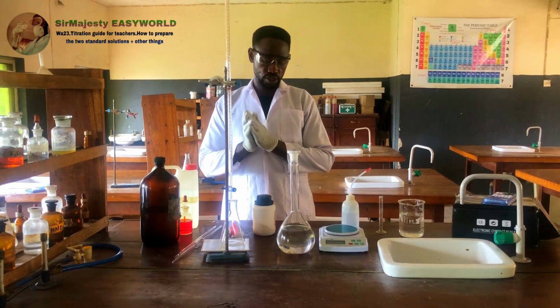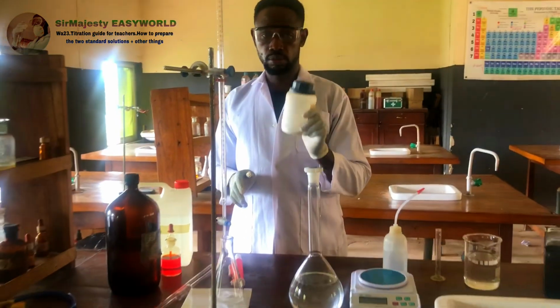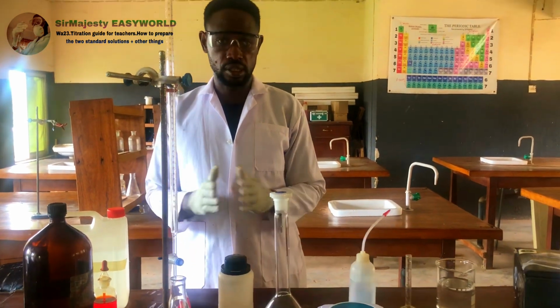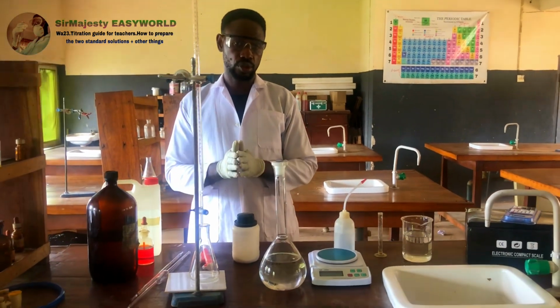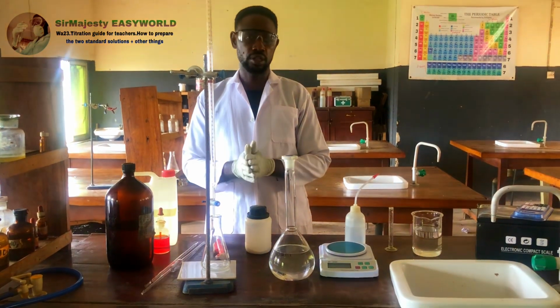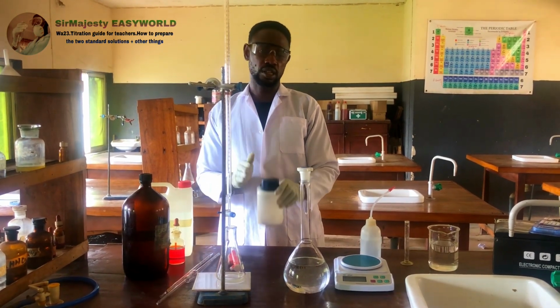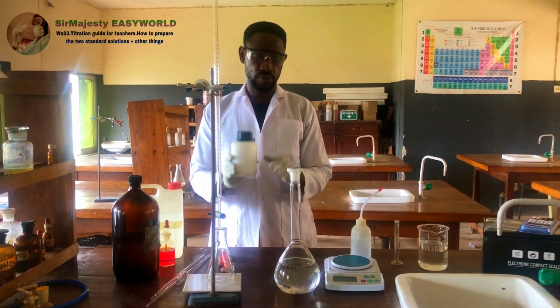The first challenge one has to face is that this particular salt, sodium carbonate decahydrate, is not stable. It's efflorescent. It loses some of its water of crystallization when exposed or when not protected well, and that will affect the mass you are measuring. So you must make sure that yours is still the decahydrate, what the label says. First, you can use heating to analyze that, which I will not be showing in this video.